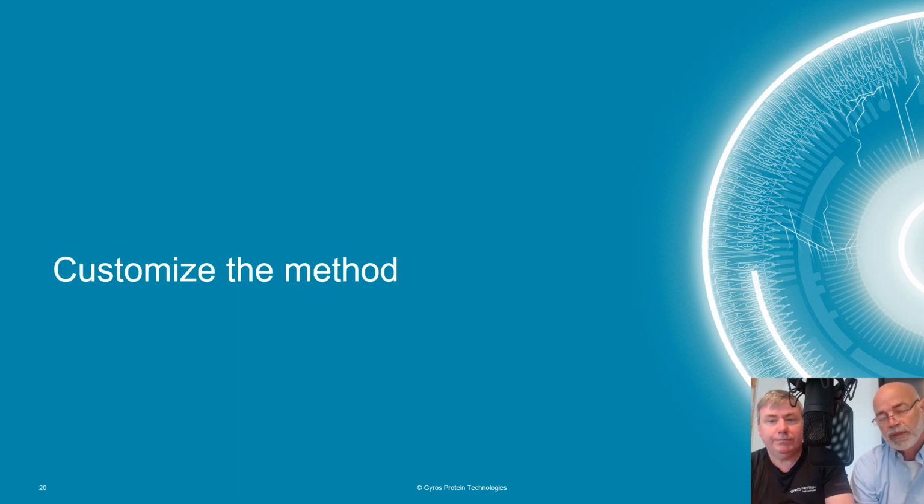We talk about this with a little bit of caution because the methods themselves are relatively locked down, and modifying methods is possible, but it can create some unwanted consequences. So we would really encourage folks out there that have a method that doesn't do everything that you want it to do to work closely with your FAS to help you modify the methods to meet your needs. There are complex microfluidics going on with the centrifugal force, so please do not play with the spin speeds; talk to your FAS or support to help you.